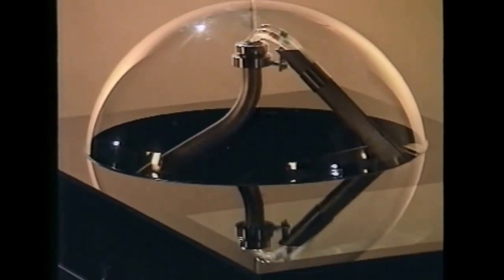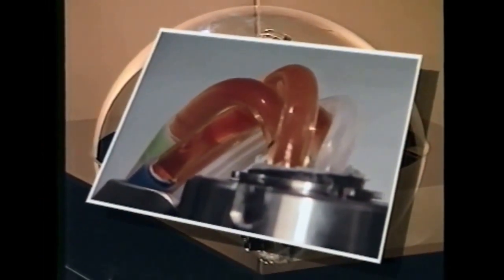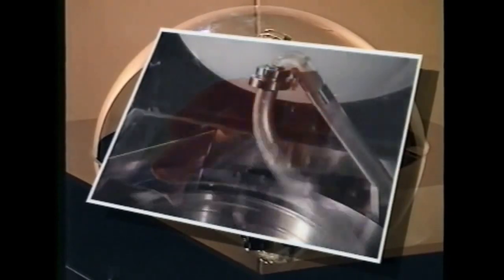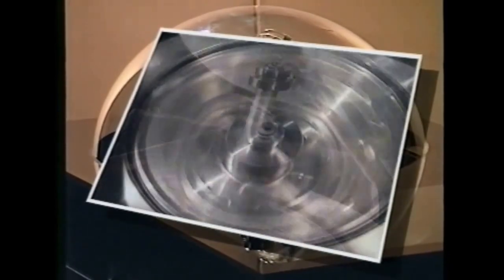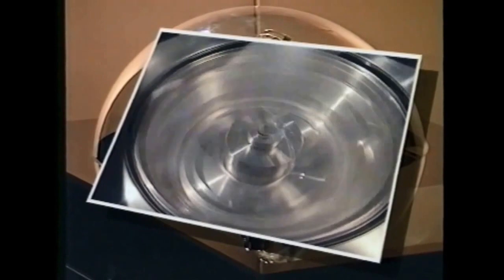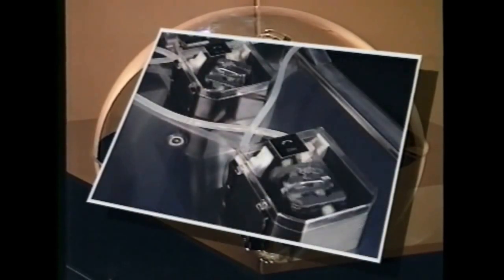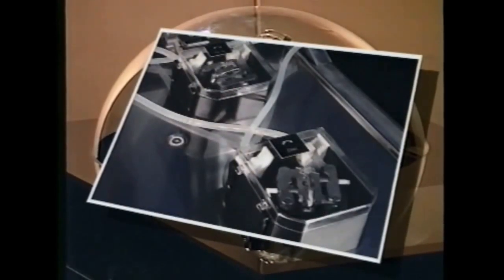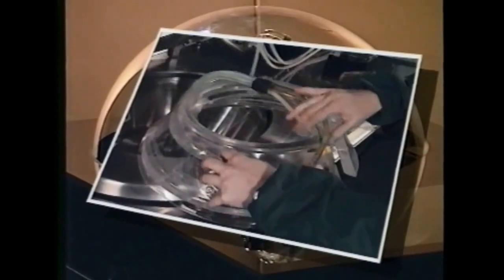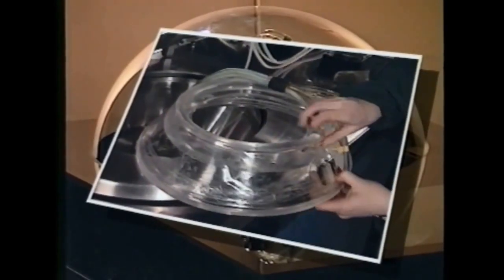The Centritech cell answers that challenge. It has no rotating seals, smooth flow path, moderate centrifugal forces, comprehensive control of flow rates and rotor speed, and it uses a completely sealed, pre-sterilized, disposable bladder.